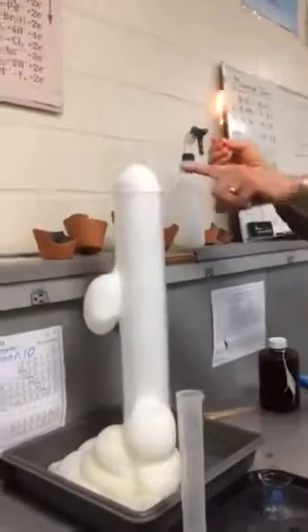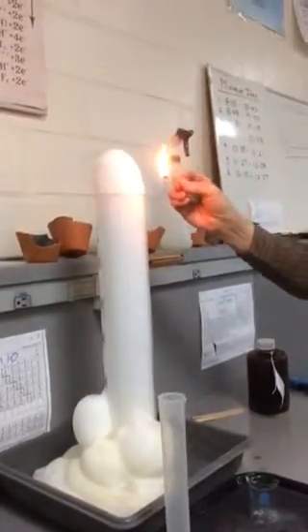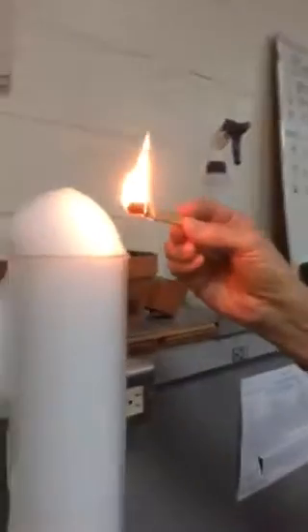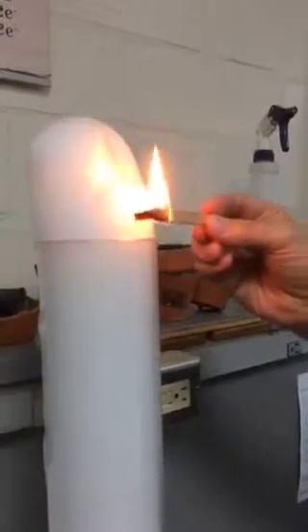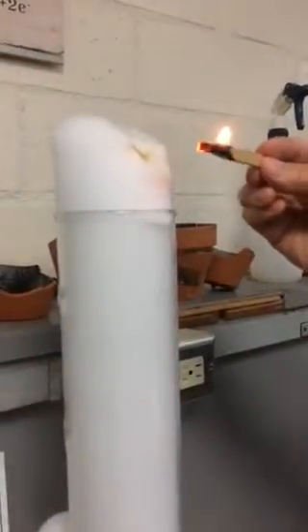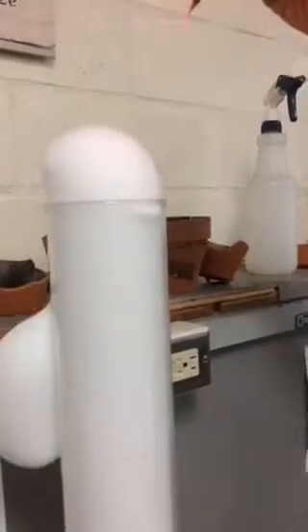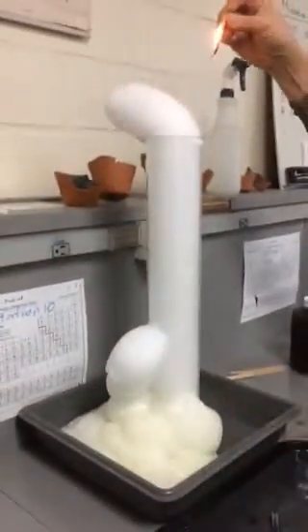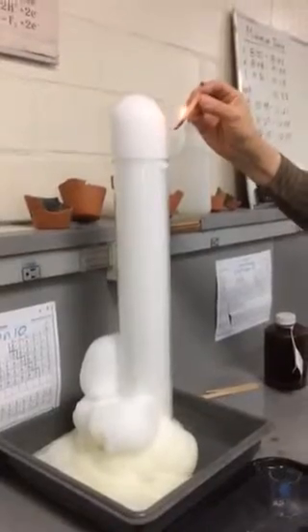Now, if there's oxygen in those bubbles, this flame is going to get brighter. So let's watch. Are you in nice and close? Yeah, get as close as you can. Is it in focus? Good. See that? Now, that wouldn't happen if there weren't oxygen in there. Okay? Now, I'm going to let this burn get back a little bit so you have the top to the bottom of the tube. And let's get this out of the way. I'm going to drop this in there, and you'll see it flame as it goes down.